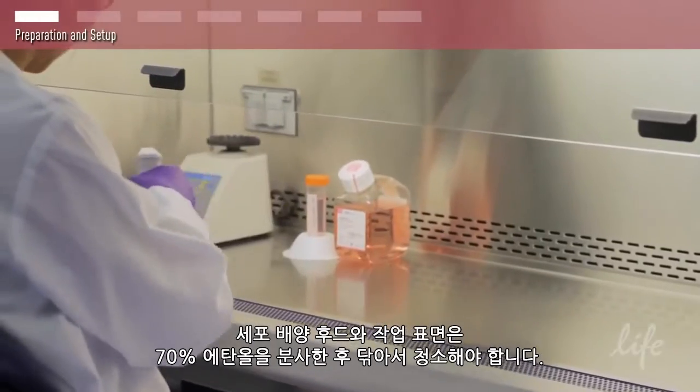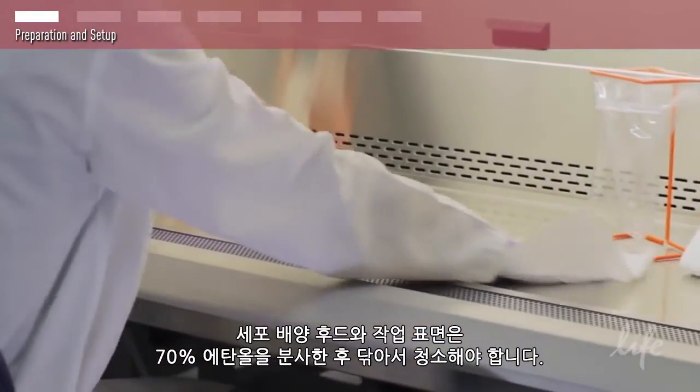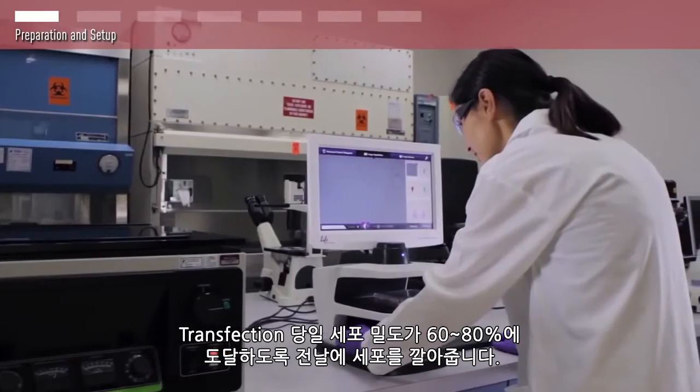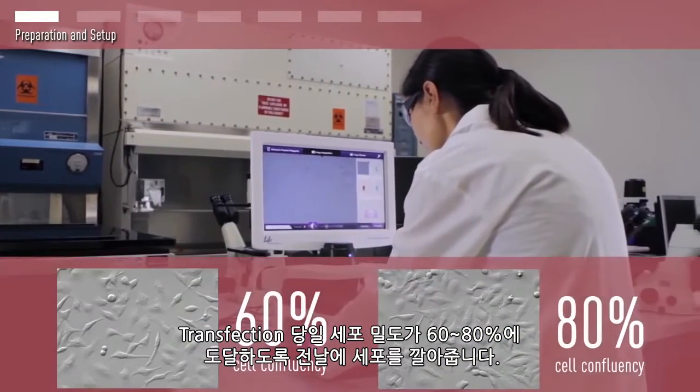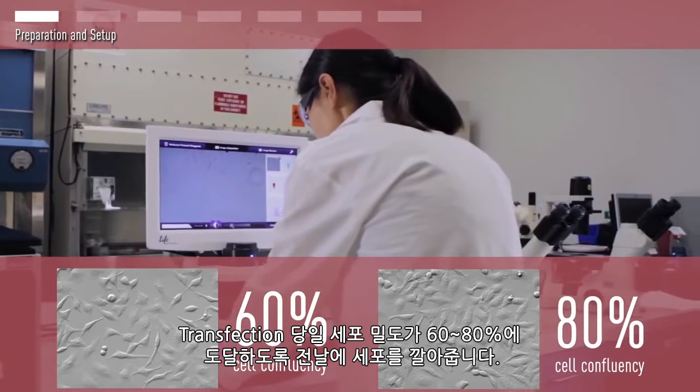Clean the cell culture hood and work surface by spraying and wiping them down with 70% ethanol. The day prior to your transfection, seed your cells so that they will be 60% to 80% confluent at the time of your experiment.